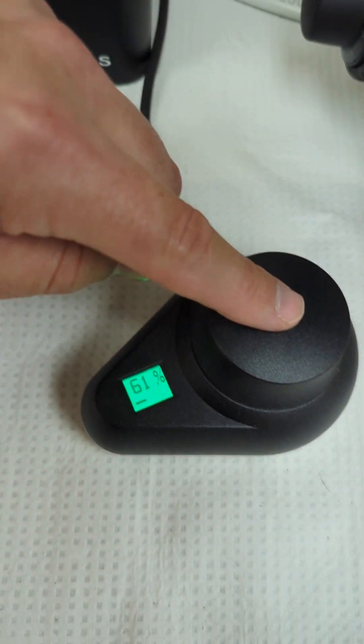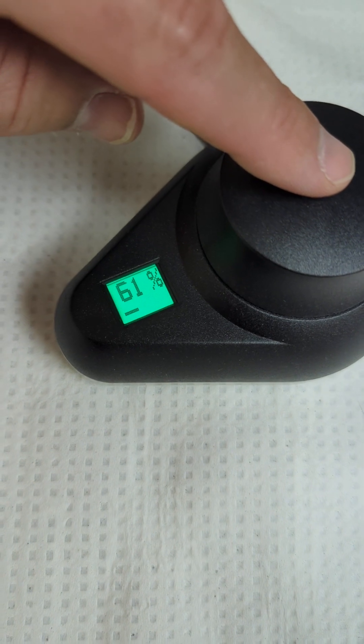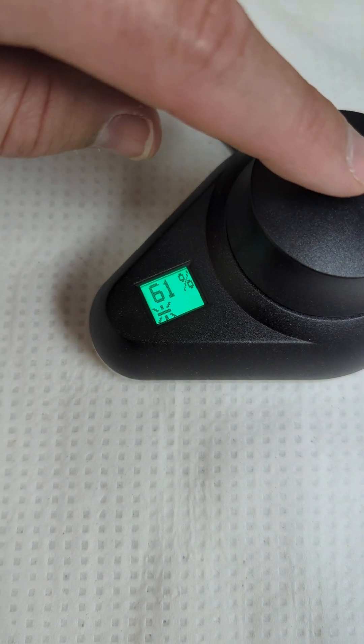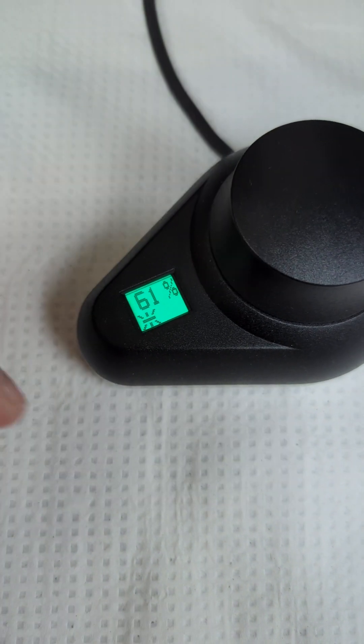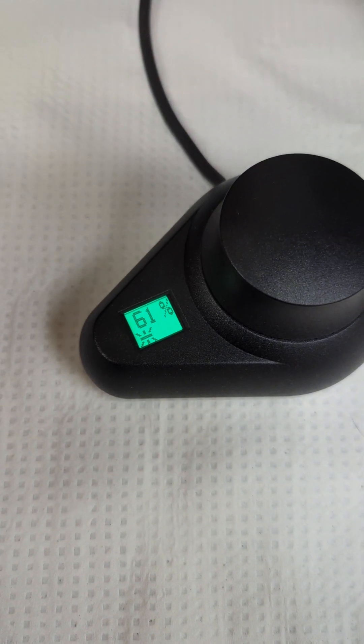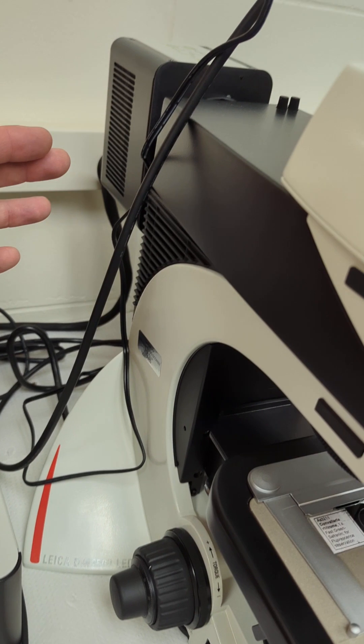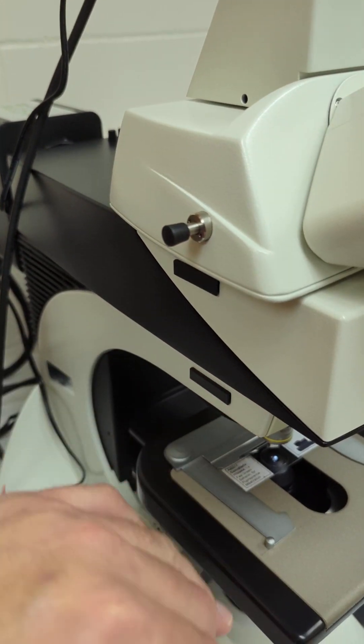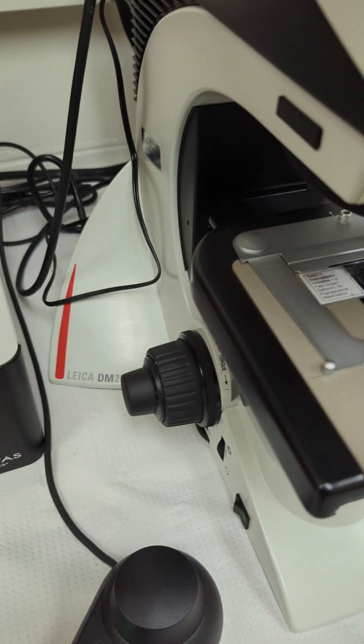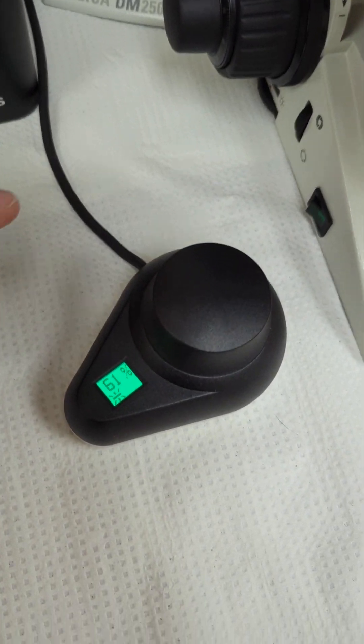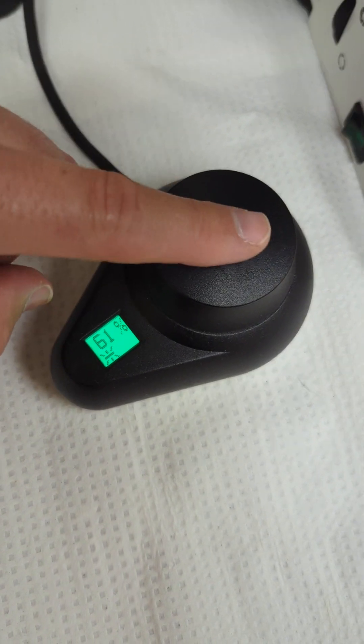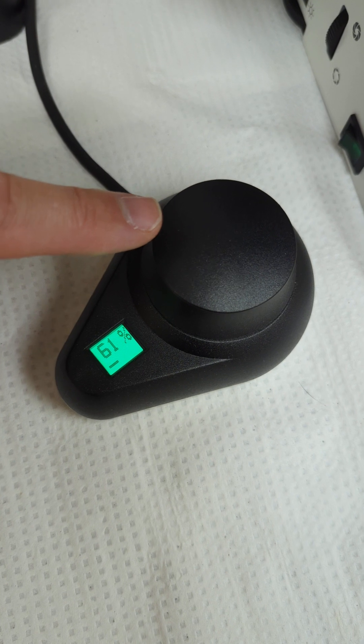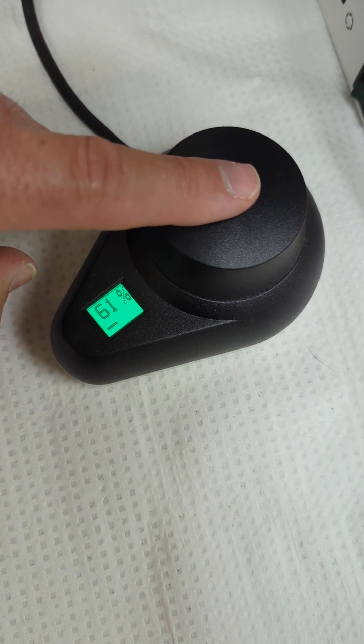You can dial it down really nice on these Excelitas units. Then you push, and you see the symbol next to the 61% change. See how bright? Look at the little symbol changes, and all your light is coming through now. So you just push the knob and the light goes on and off. This is your shutter.